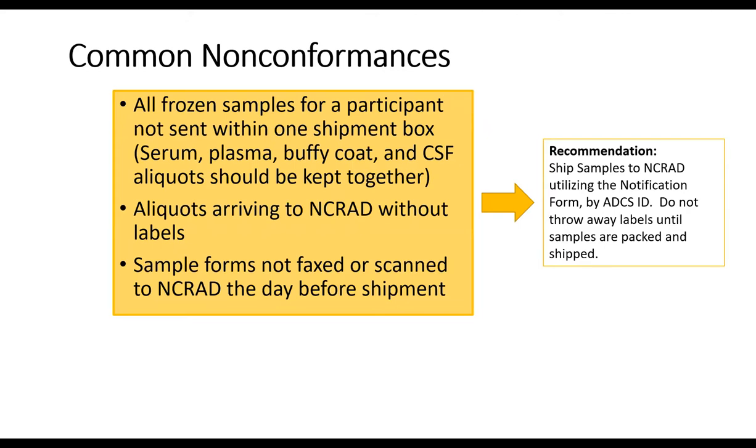That's why we don't necessarily say to send the boxes from a certain number of visits together or a certain number of subjects. We say send 6 cryo boxes because there could be just a blood sample if it's a week 4 visit, or if it's a week 24 visit, there could be the blood products and the CSF products. So please keep that in mind when you're packaging the samples.